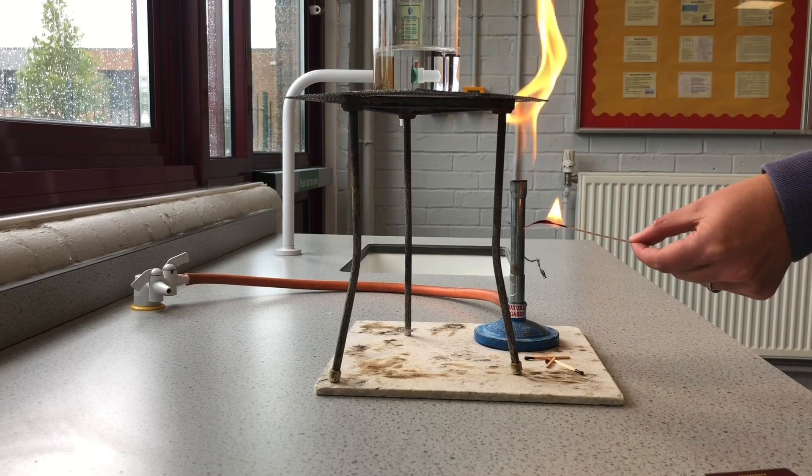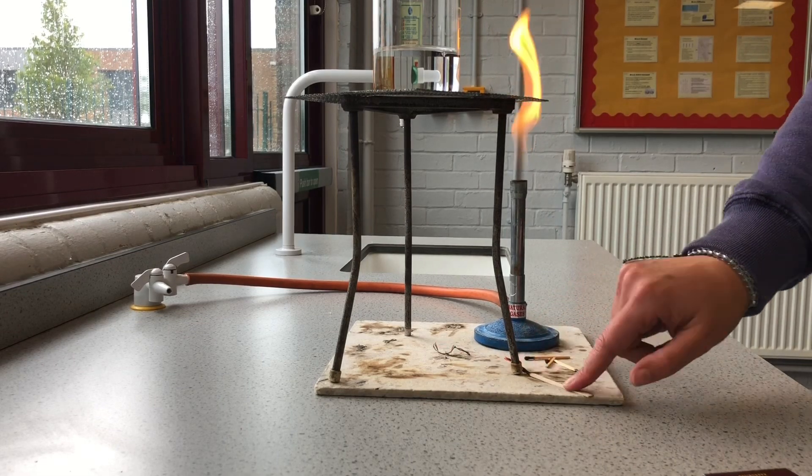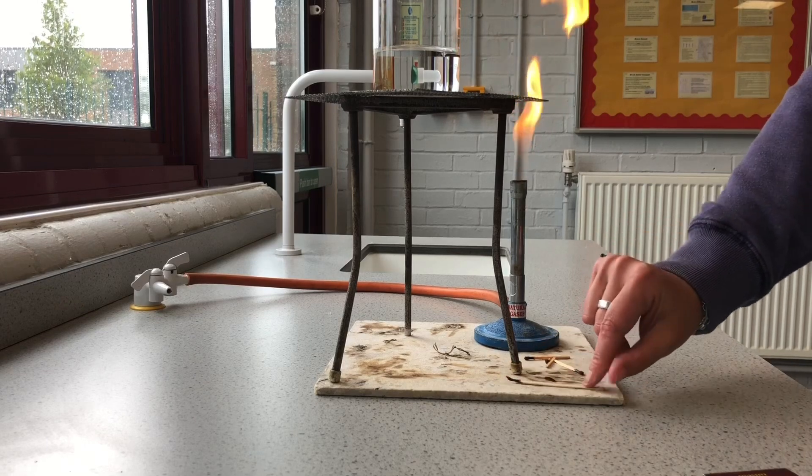I'm not going to blow the splint out because that would blow my Bunsen out too. I'll just place it on the mat, and you can see it goes out pretty quickly. Everything stays on the mat, not on the table.